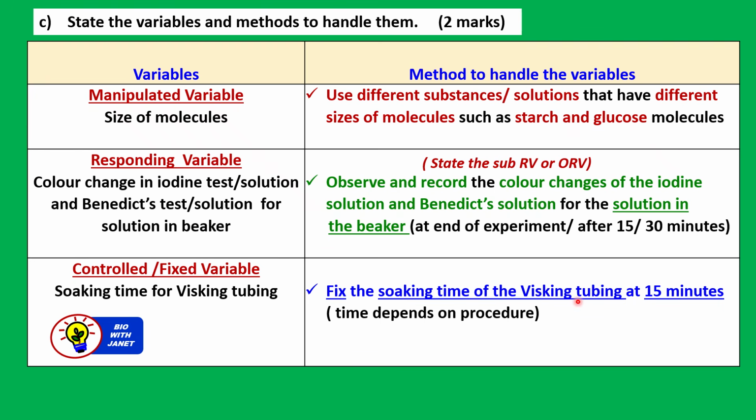minutes, or it could be 15 minutes, because in the exam they cannot let you soak for 30 minutes, it's too long, okay? So for 15 minutes or whatever time is stated in the procedure, write that down. So you have to highlight the fixed variable in your question. Make sure you know, in case they ask you for the method to handle the fixed variable.